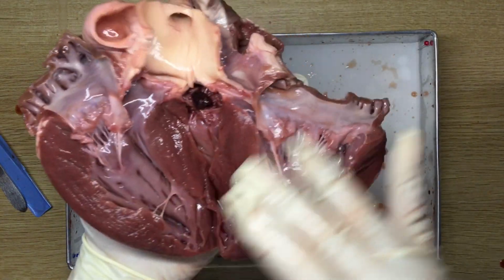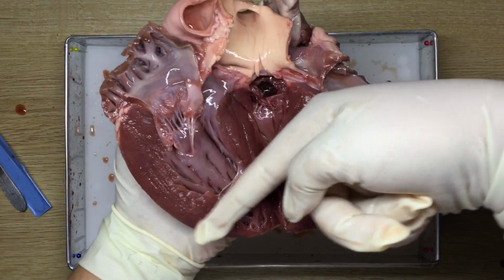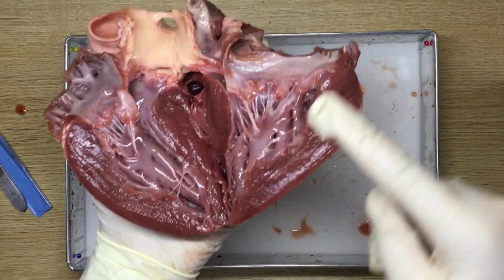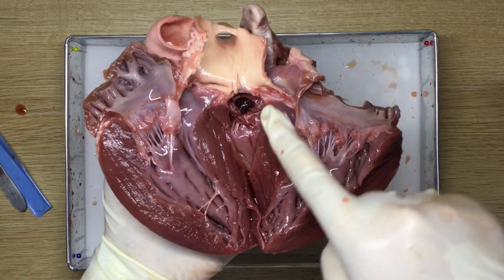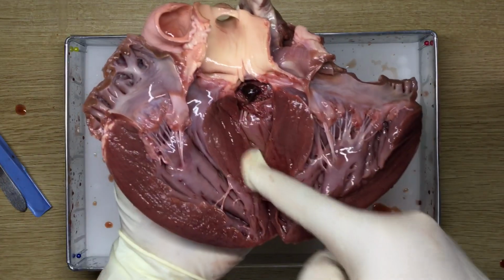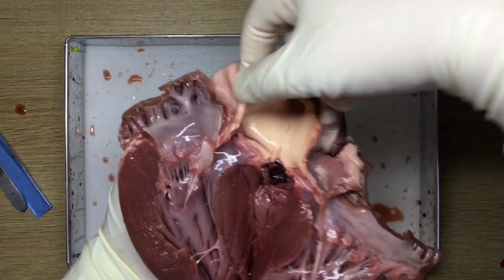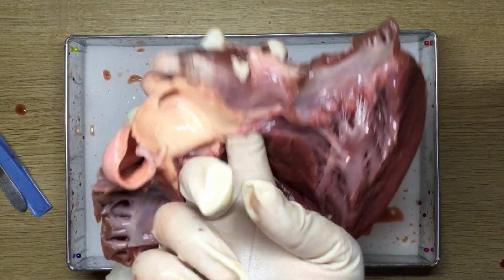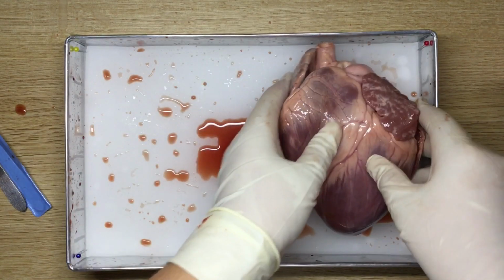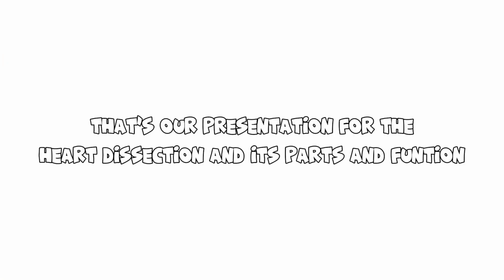This is the right ventricle, and the valve in the right ventricle is the tricuspid. The right ventricle carries the unoxygenated blood and exits through the pulmonary artery, and it will go to the lungs in order to be oxygenated. There's this small hole inside the aortic semilunar valve which leads to the coronary artery which feeds the heart. That's our presentation for the heart dissection and its parts and functions.